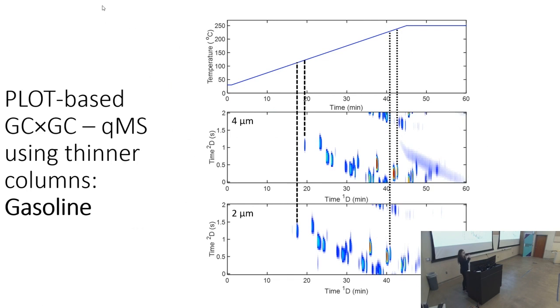This is starting out at 30 degrees, not 100 as before. And between the 4 and the 2, it is tracking the same thing that happened in 1D. We went down by about 10 to 20. So once I run the 8 micron column, it will be much, much more to the right side. And then for some of these heavier things, it's doing very similar things.